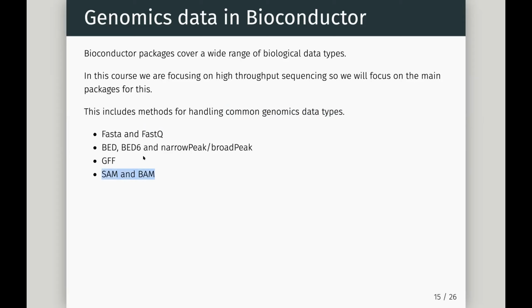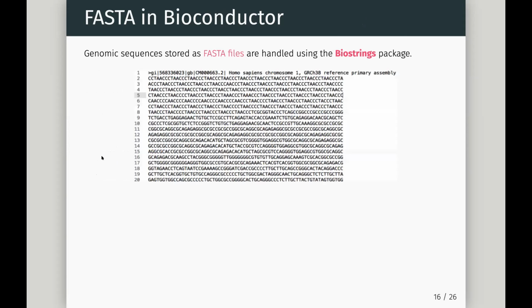Can we handle those in R? We can. Different variations of the bed files, the bed6 that has names, strand, and score, or encodes narrowPeak and broadPeak, just the extended versions of bed6. And also our gene models, we want ways of handling them in R too. Great. So now I can just start to give you examples.